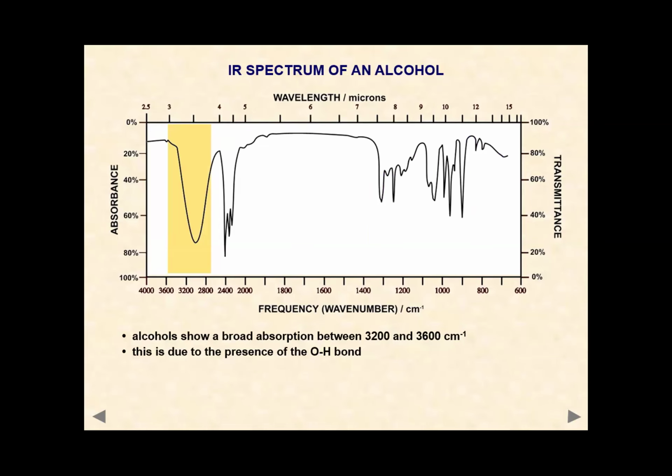All right. Now, what happens if there is a carboxylic group? I hope that you remember that carboxylic acid is C double bond OOH. The name carboxyl is a combination of two groups, that is carbonyl plus hydroxyl. So when you add carbonyl and hydroxyl group, then you get carboxyl group. So that means that in carboxylic acid, you are going to get two peaks.